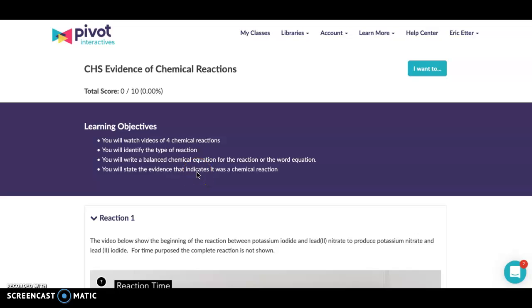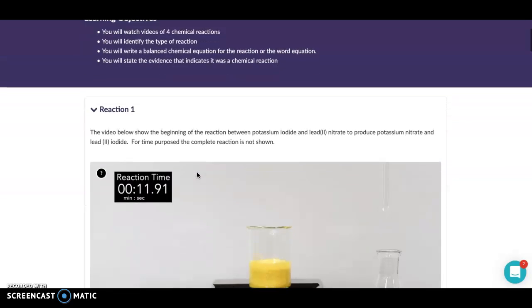Welcome to second semester, and this is the first lab for second semester where you will be looking at evidence for chemical reactions. There are 4 reactions in this video, and in each reaction you will be balancing the equation for the reaction as well as providing evidence that you know a reaction occurred. So let's just take a look at all 4 of them really quick.